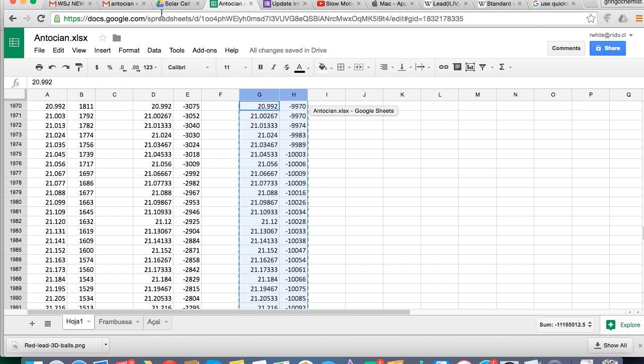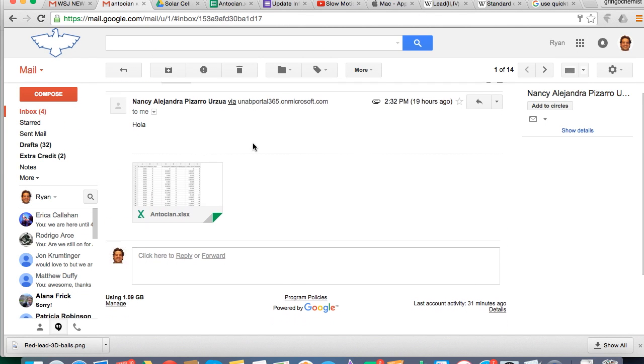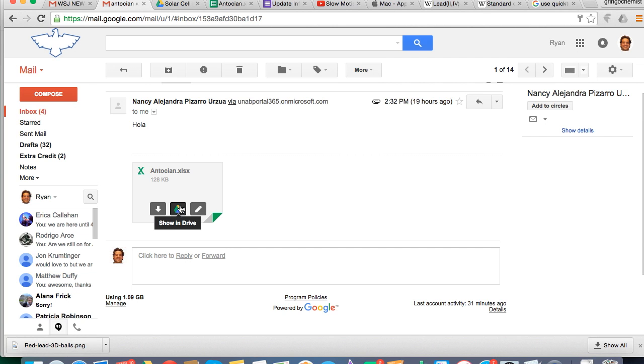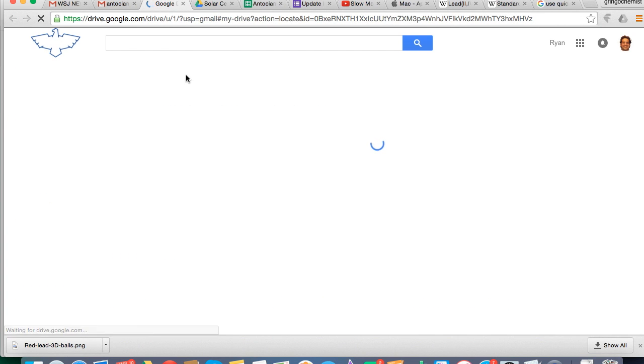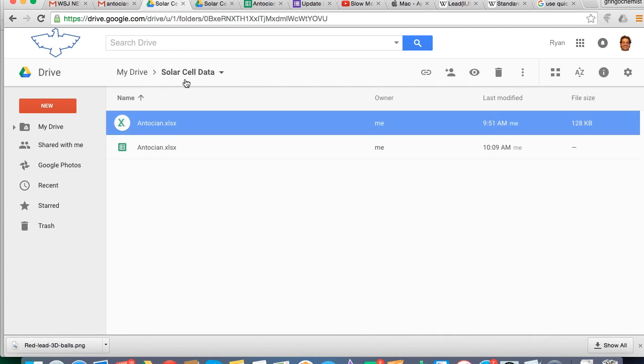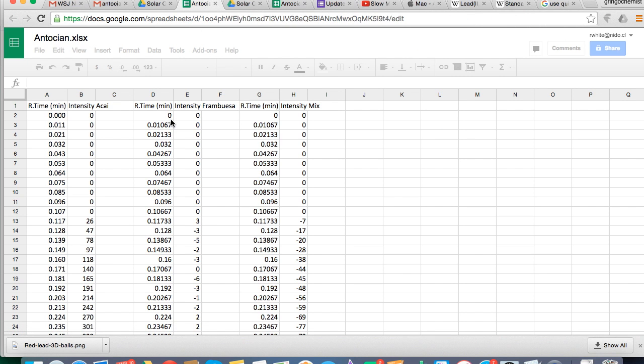So first thing is you want to go to the email that I sent you. The file is right here and it's basically just a bunch of data that's in a spreadsheet document, so you can open that up with whatever you want. You can use Excel, you could use Google Sheets. That's what I do just because it's easiest.